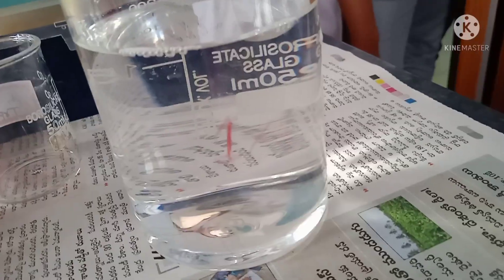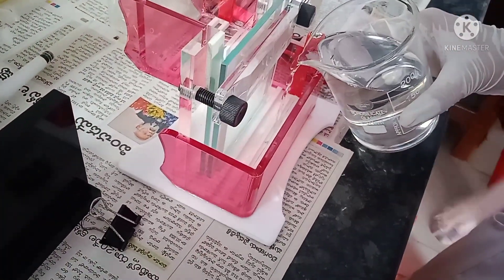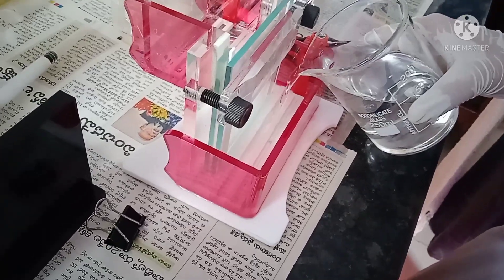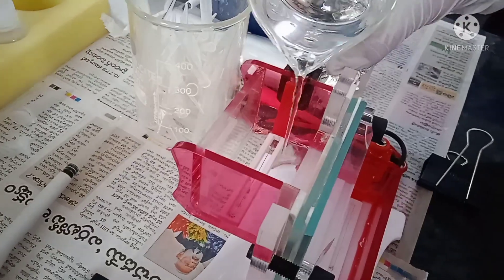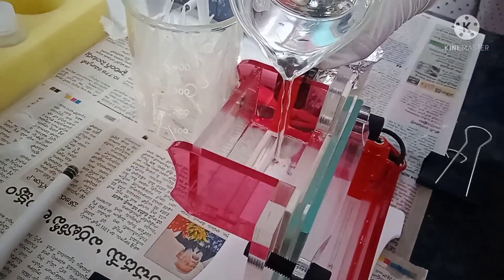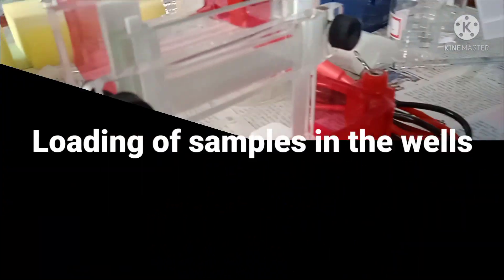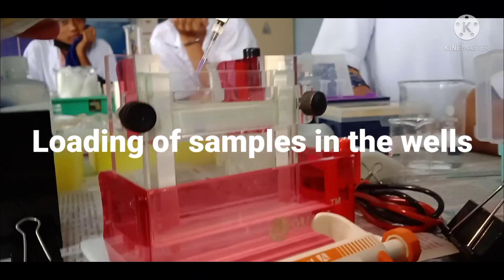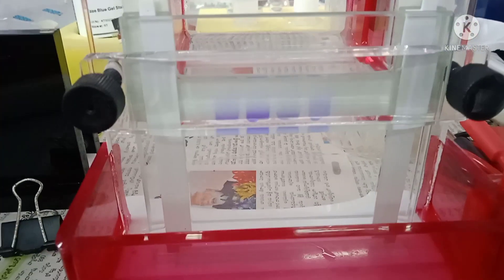After fixing the gel cassette to the electrophoresis chamber, fill the reservoirs with 1X buffer. First fill the lower reservoir, then fill the upper reservoir. While pouring buffer into the upper reservoir, observe that the wells are filled with buffer — it is necessary to fill the wells completely. After that, load the samples into the wells after the incubation time is complete, picking the samples and loading them into the specific wells.